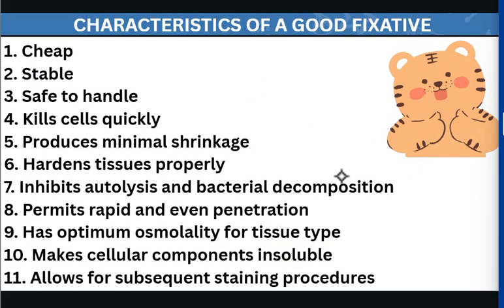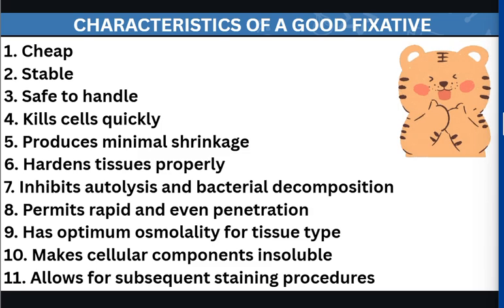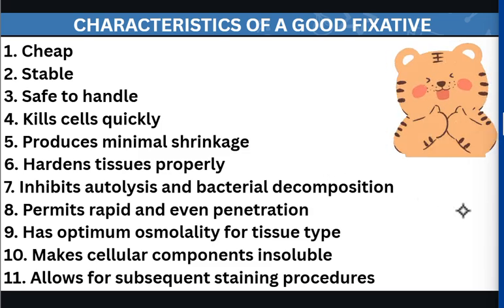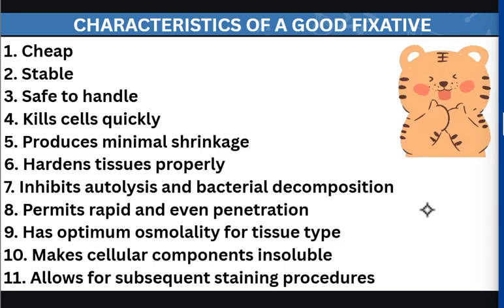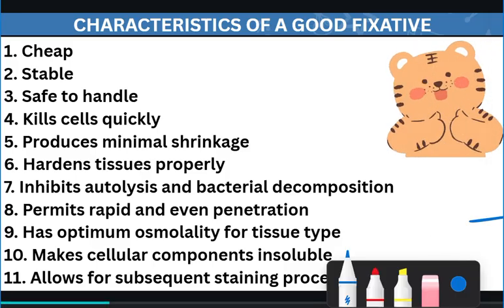So here are the following characteristics of a good fixative. Please read them. Class, of course, it must be cheap, stable, and safe to handle. Okay, and it must really preserve the morphology.